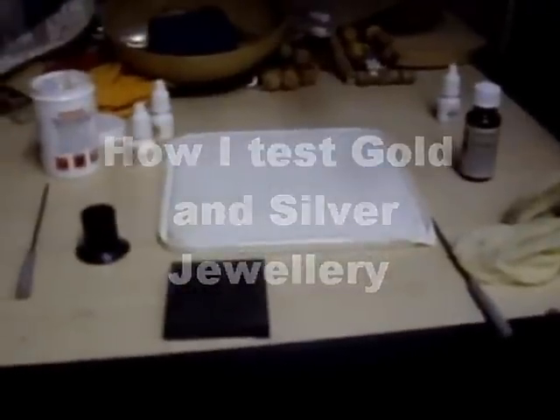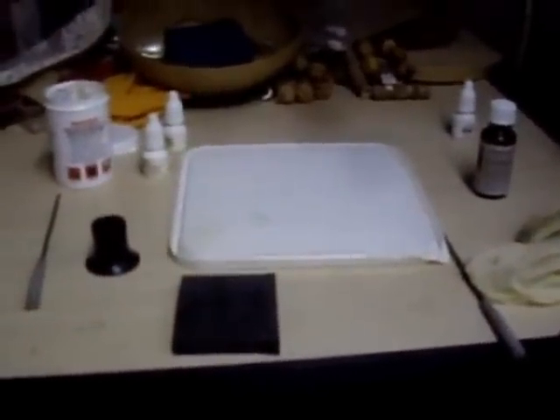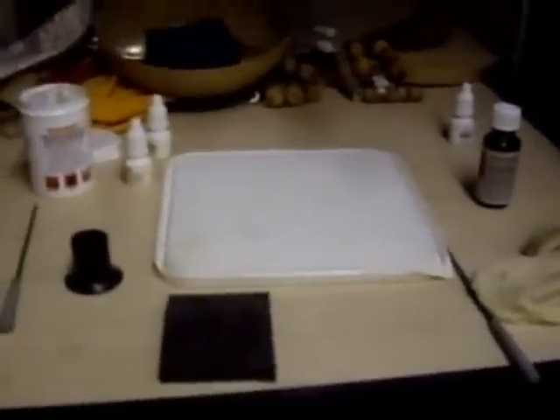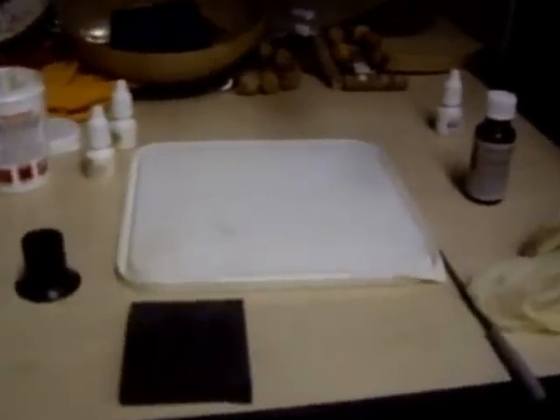I'd like to show you my silver and gold testing area and the setup I have for testing precious metals. I've got a plastic tub tray which I can clean off — it protects the worktop and also keeps all the acids contained so I don't get any contamination or burn myself, because they are quite toxic and can be quite corrosive if left unchecked.